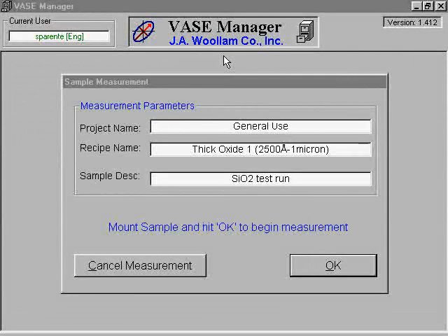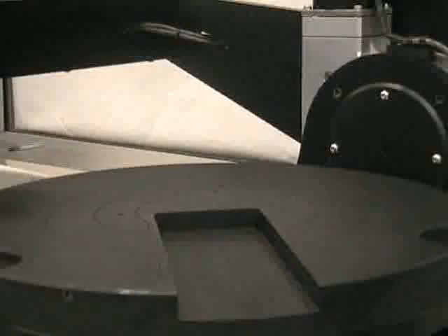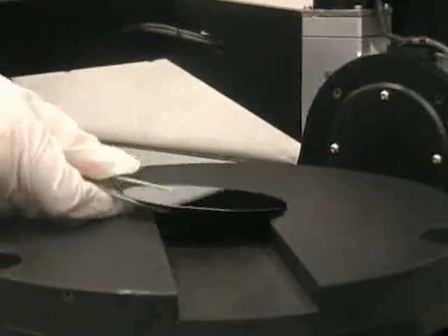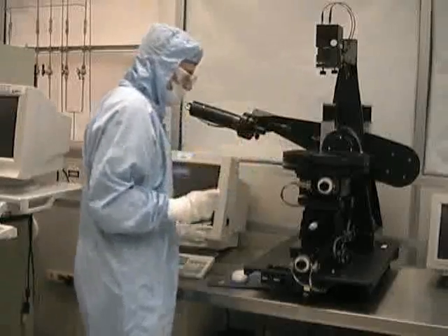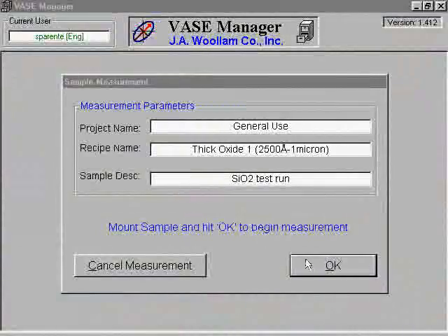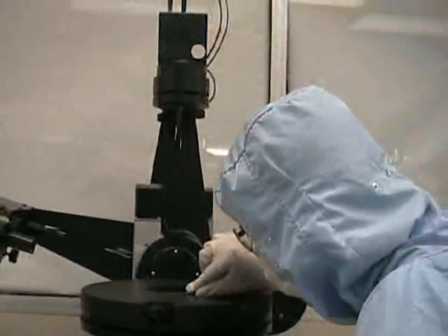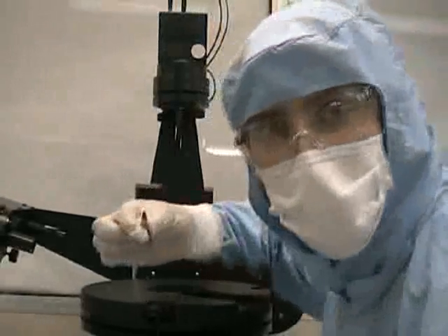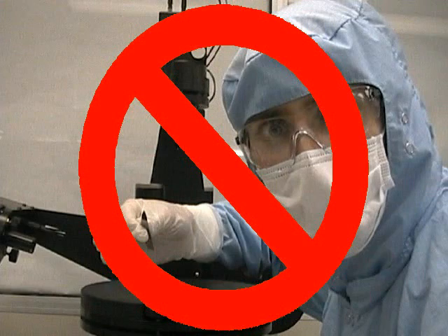You will now need to prepare the ellipsometer for the scan. The software will provide you with a summary of the scan that you have set up. If this information is correct, place the sample onto the sample stage. It should be roughly centered, but does not need to be exact. Flip the vacuum switch, which is located at the base of the ellipsometer, to Vacuum, and then select OK. Do not attempt to adjust your sample when the vacuum is on, as doing so can cause your sample to break.